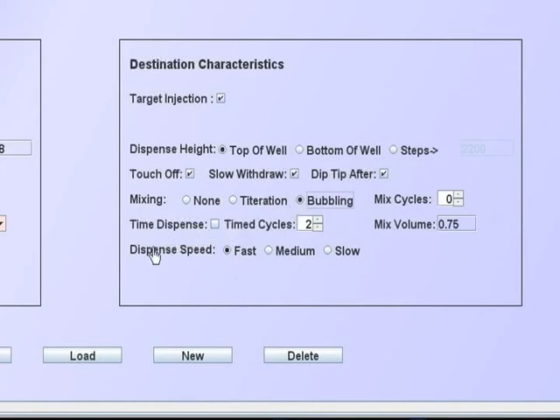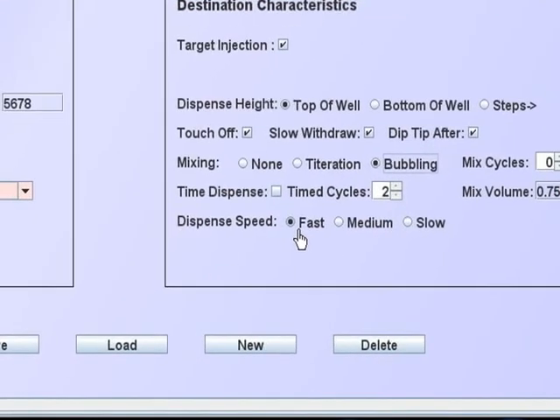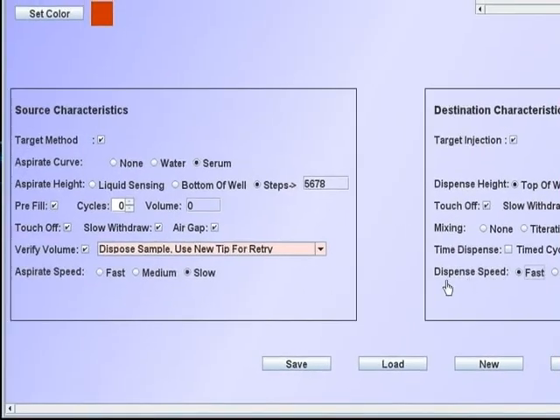The dispense speed is self-explanatory. In most cases, a fast speed may be used, since the piston is forcing the liquid from the tip. However, this needs to be judged on each specific case.